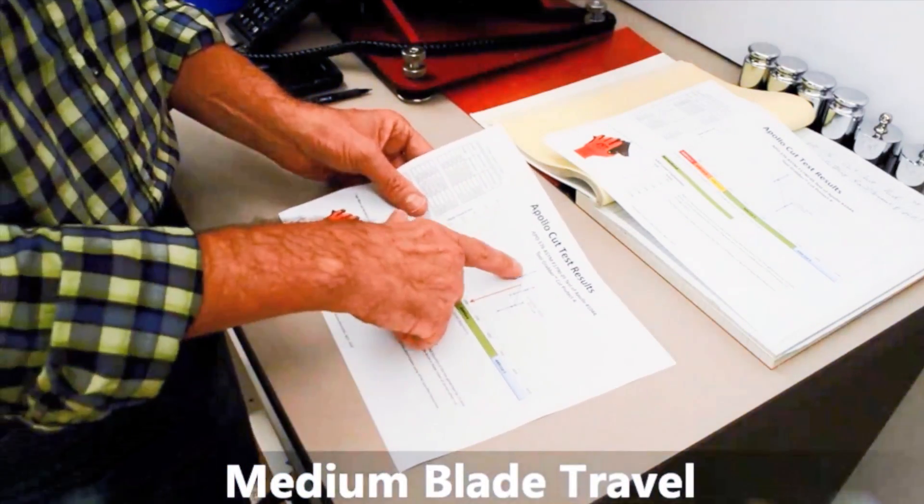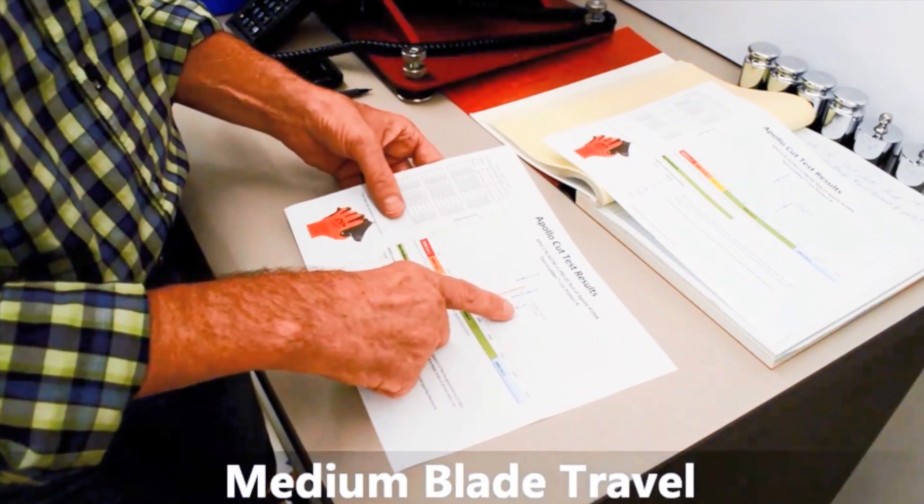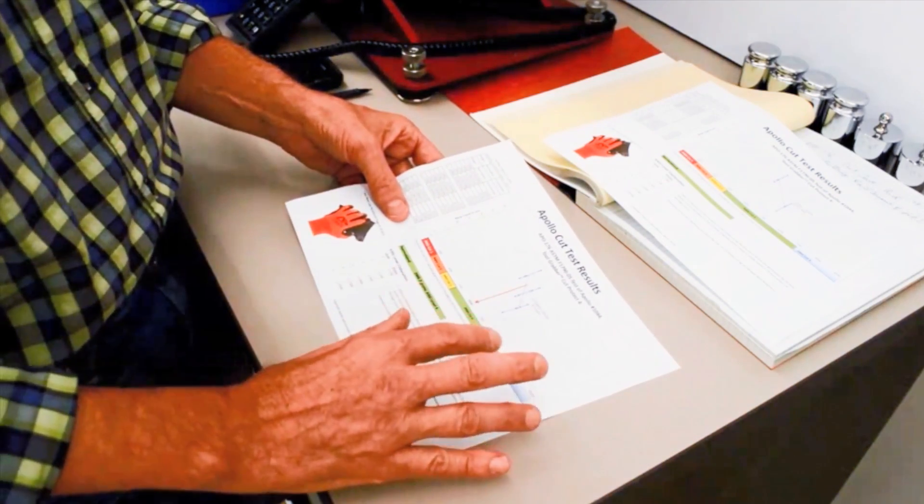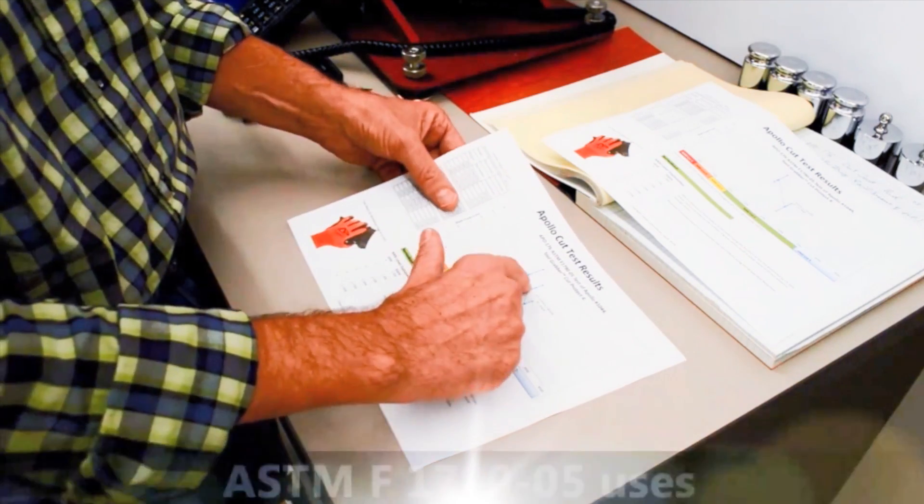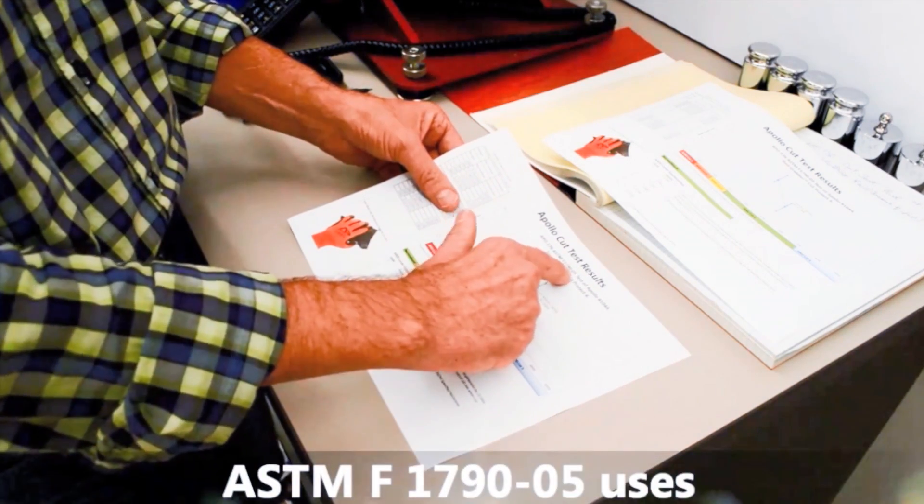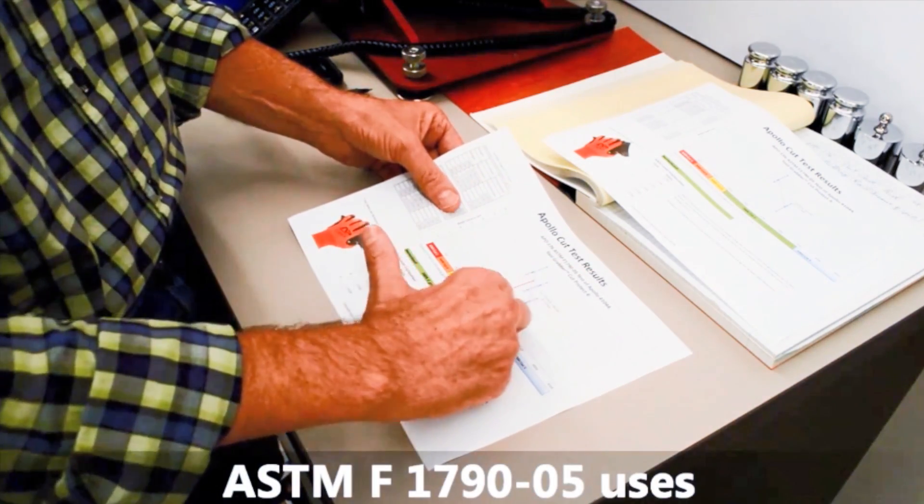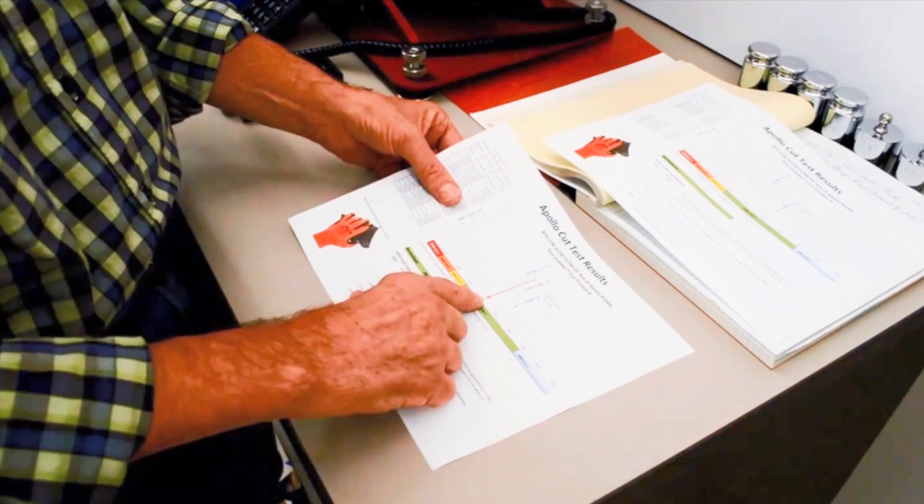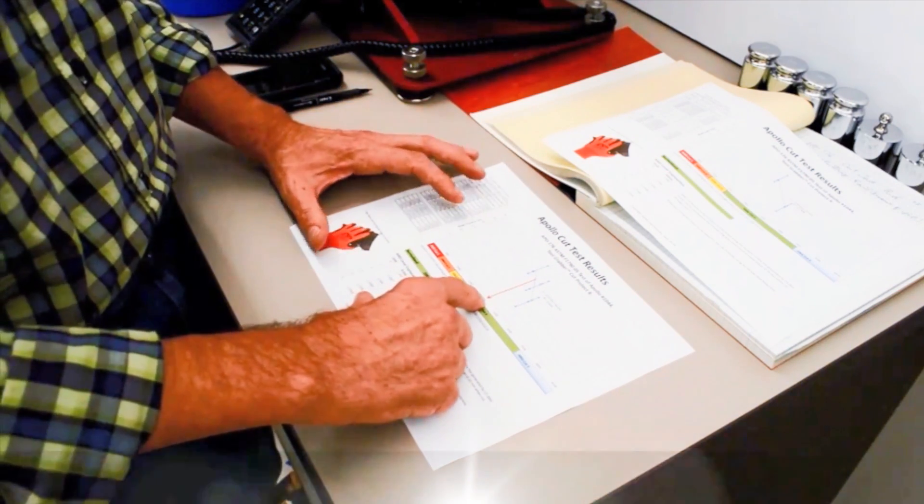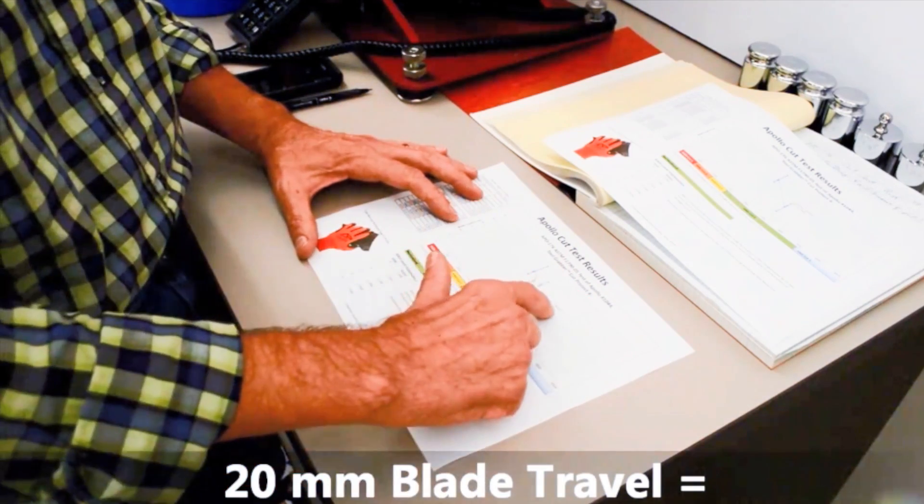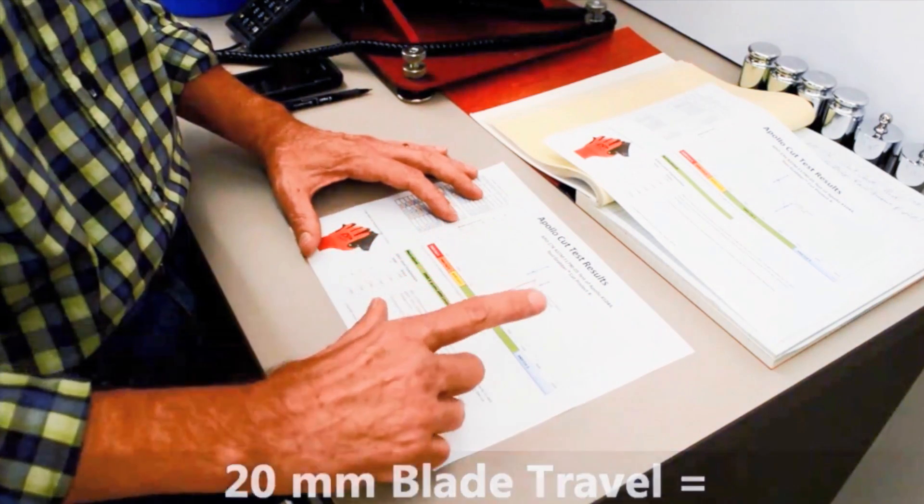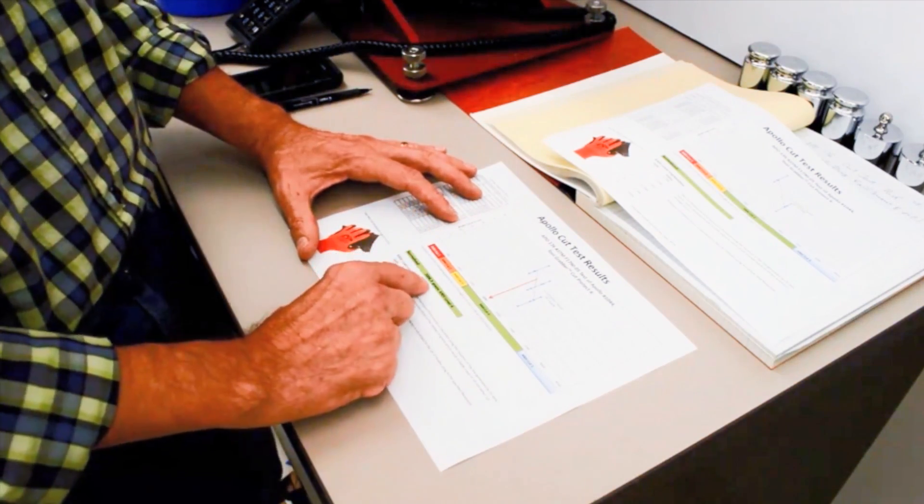And you can see from the line that what you do then is you look for the place on the line where there's 20 millimeters of blade travel per the ASTM F1790 standard. So you can either draw the line there and see that it's a little over 2,000, or we think it's more accurate to use the equation of the line.